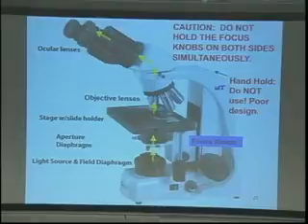Wait till the microscope in front of you. Start doing some exercise with them, okay? So here's a light source. We have a field diaphragm here. It has a series of plates, so you can close down how much light there is. So you don't want too much light. There's another set of diaphragms here called the aperture diaphragm.